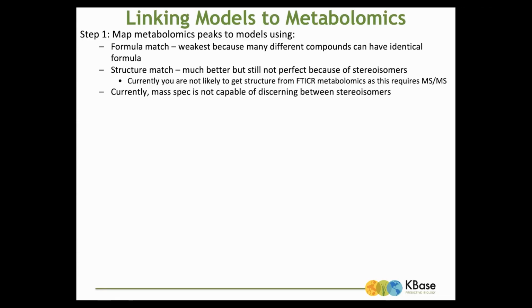If they give you an InChIKey, and they will, if you do MS/MS with Trent Northen or Oliver Fiehn or one of these metabolomics labs, or at EMSL with Tom, just be aware, go ahead and strip the stereoisomer information off of that InChIKey and do a match on the base of that key, because metabolomics can't give you stereoisomerization at the moment.